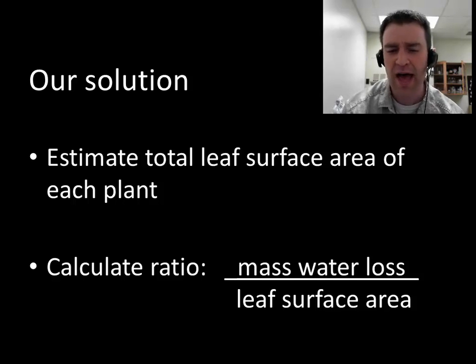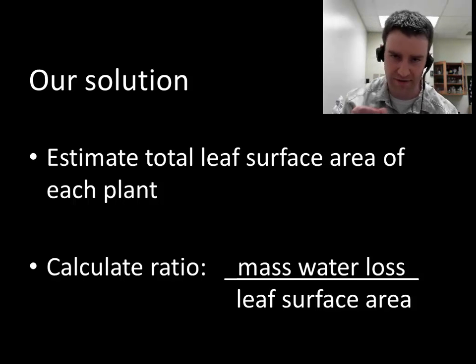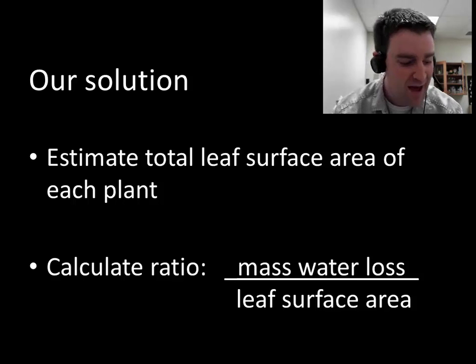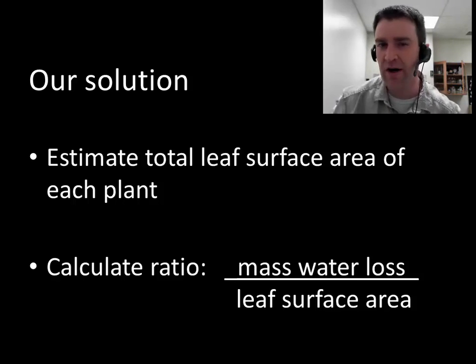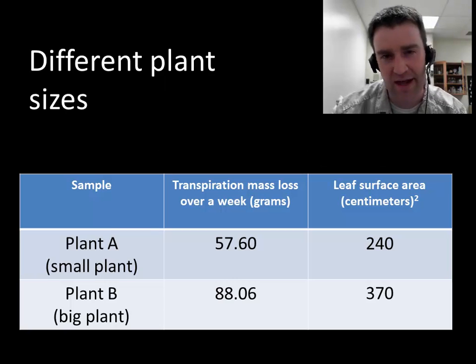How are we actually going to estimate the surface area of leaves on each plant? We're going to take all the leaves off the plant — we'll pinch the leaves off as well. That will leave the plant looking really sad, but the leaves will actually grow back. We'll mass the leaves and then do a simple conversion to estimate, based on how much mass of leaves there are, how much surface area those leaves cover. We'll talk more about exactly how to get those surface area numbers in class.